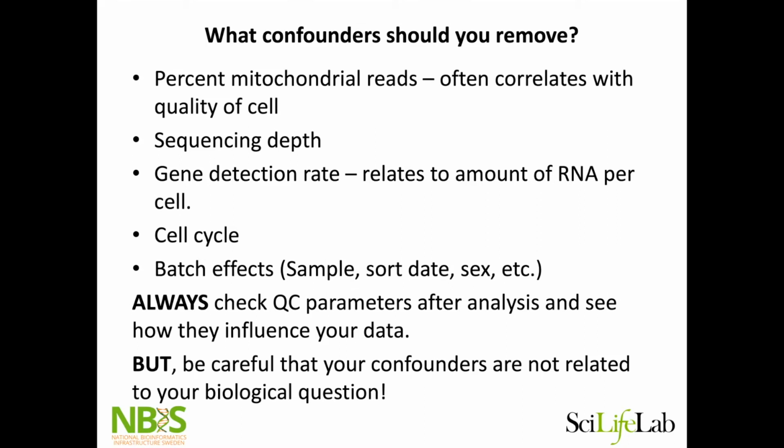Batch effects you can remove with this linear regression, but there are a lot of issues if you don't have perfectly matched populations between them. But I think Paulo will talk more about that in his lecture. So there are better ways to remove the batch effects than doing regression. And then I think it's always a good idea to check these QC parameters like mitochondrial reads and so on before and after you do these regressions.